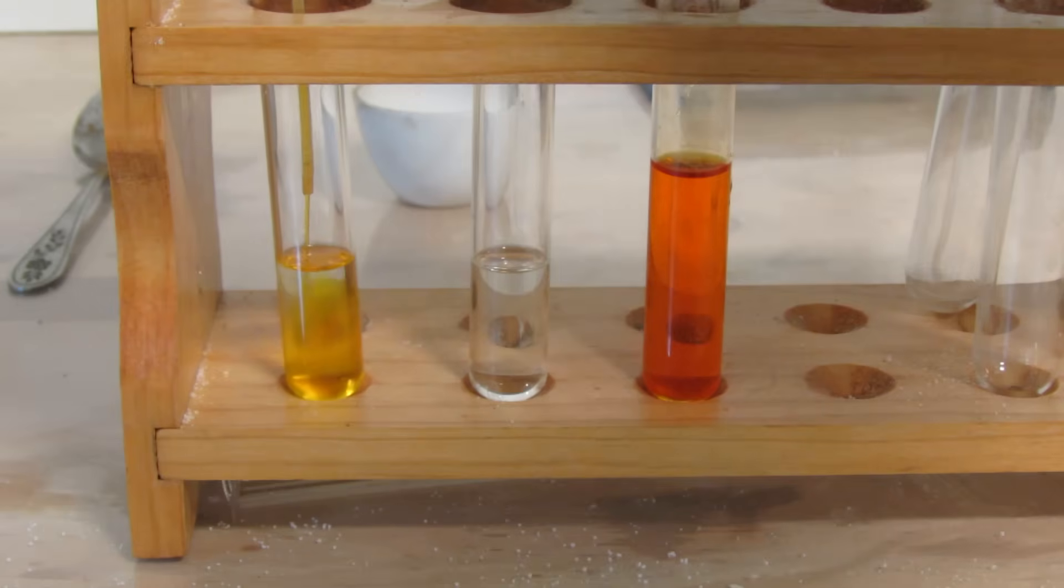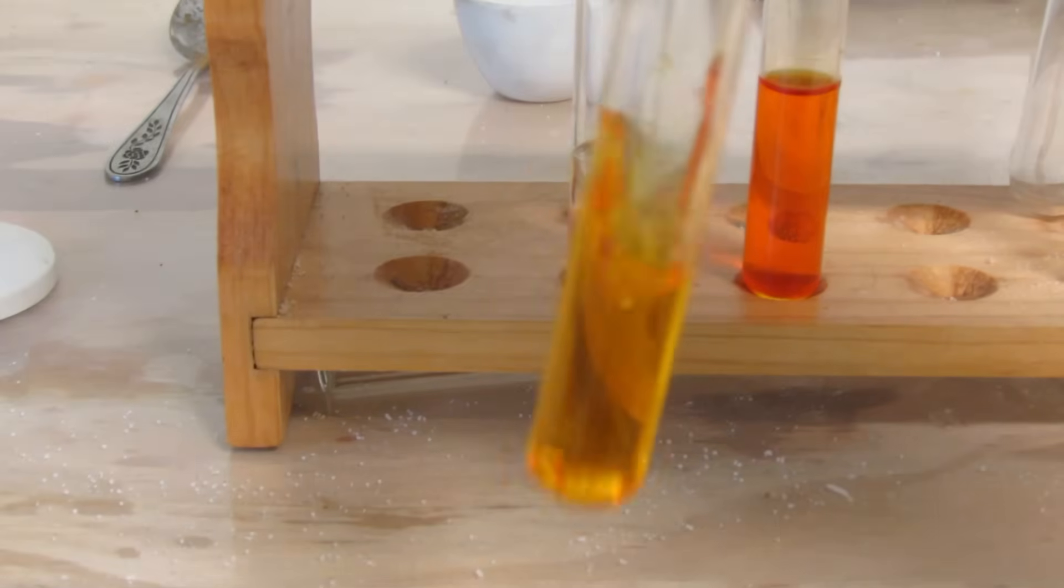First, I'm going to use a pipette to put some bromine water into the alkane molecule. You can see that the bromine water turns it a dark yellow color.